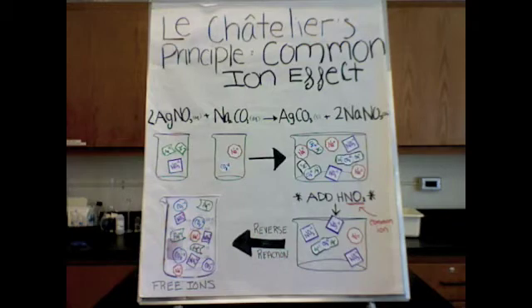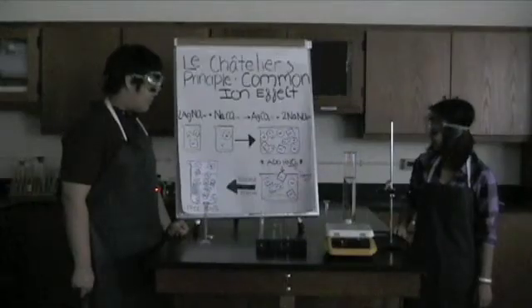Le Chatelier's principle describes what happens here. The nitrate ion, which is a product of the first reaction, is added. This causes the reaction to shift left, speeding up the reverse reaction. As a result, the silver carbonate redissolves. I created more reactants.